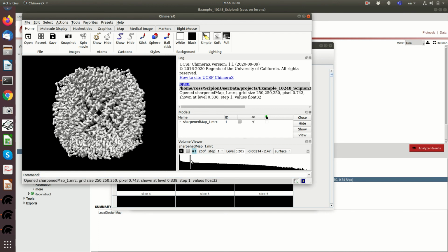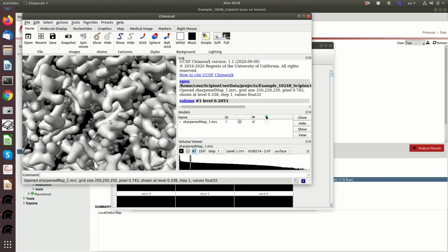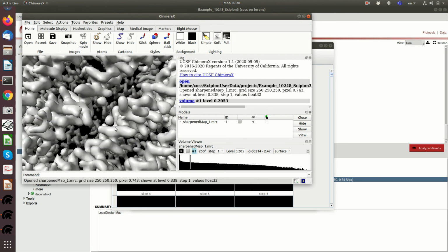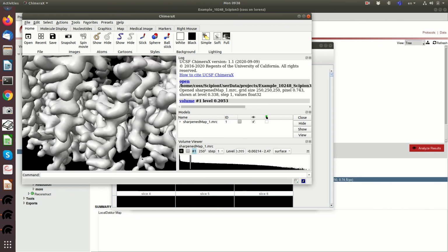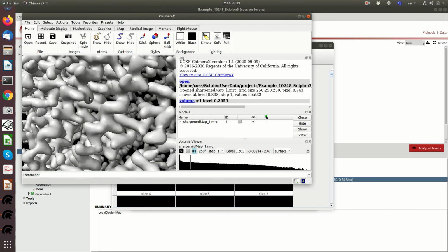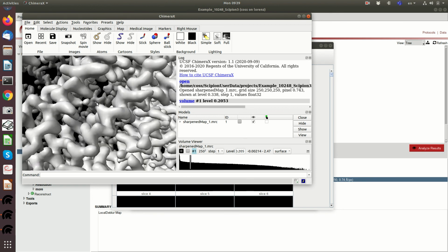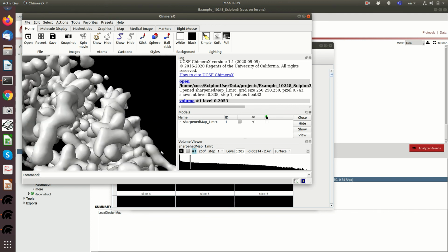But this further refinement, at some point it may introduce some bias. So don't be too greedy on these kind of refinements. But on some features like these alpha helices it has worked absolutely great with only 1500 images. And from the other branch, the angular assignment error validity, we see that the directional is absolutely great.